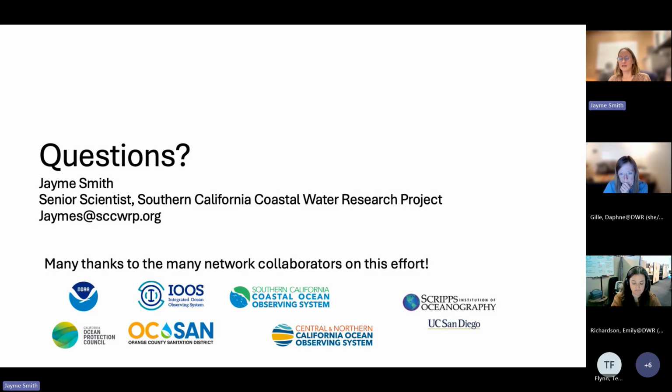Because what you would want is, you can't just take images from anywhere. They need to be IFCB images. That's the bummer, where you're like, oh, there are thousands of great pictures of Microcystis, but that's not what the neural network is going to use. You need images that are collected using the instrument.